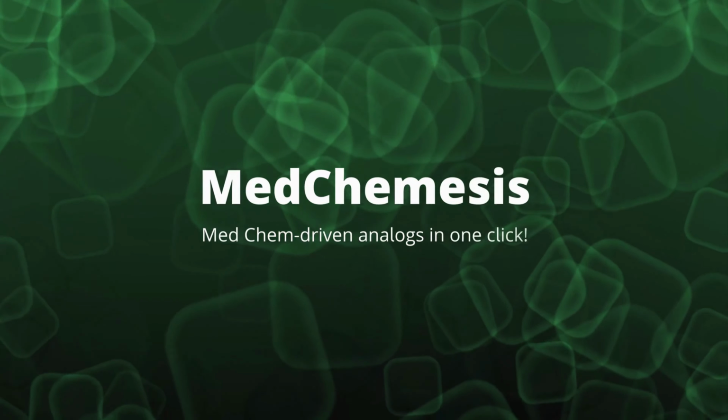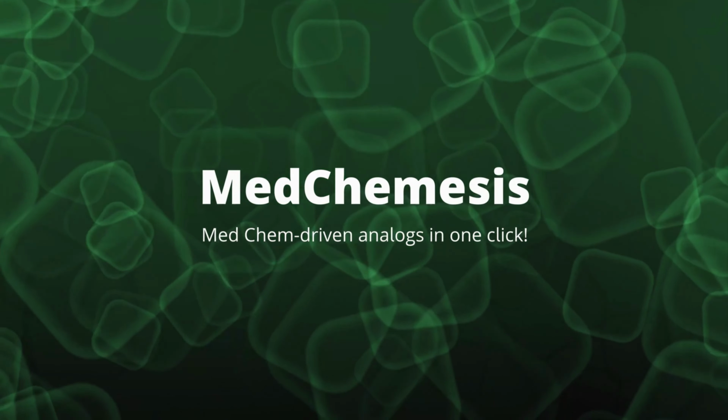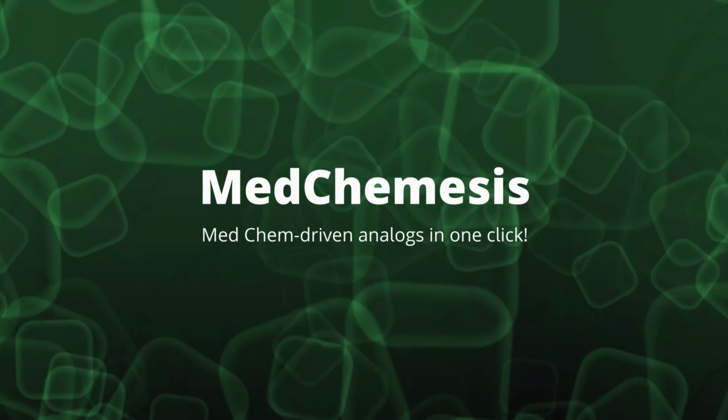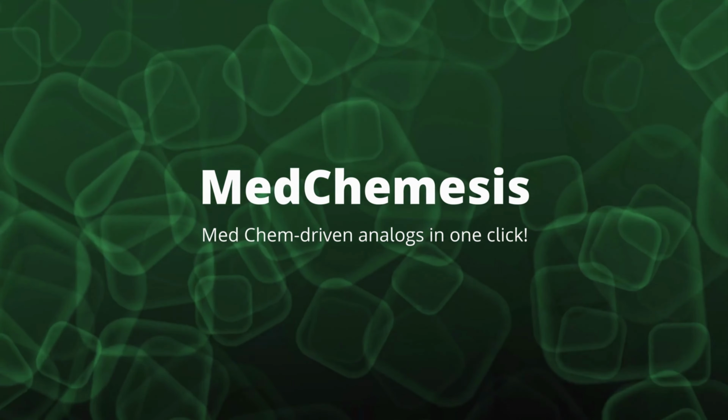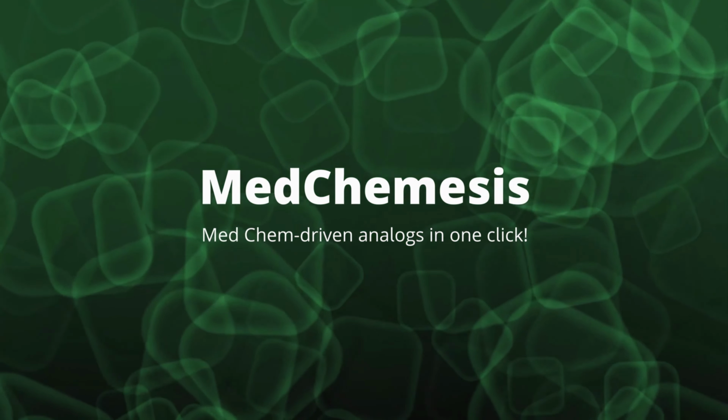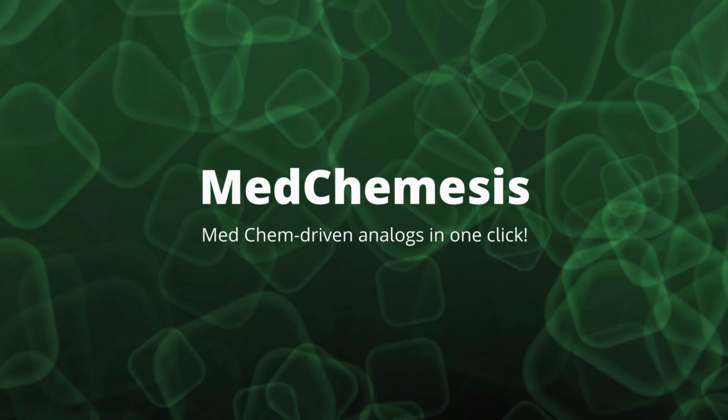Introducing MedChemesis. One of the biggest functional highlights of SeeSAR 13 is MedChemesis, a game-changing capability that takes center stage in this release.